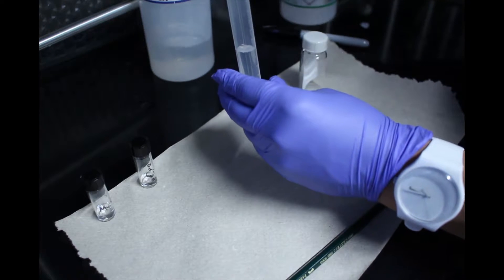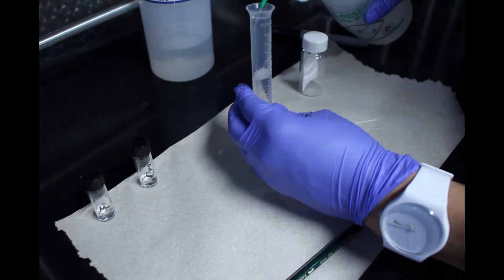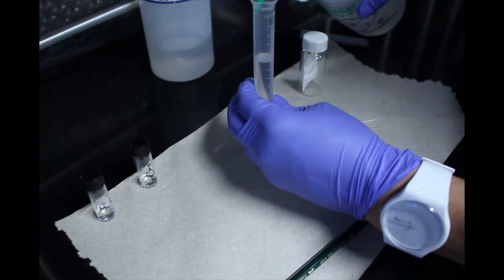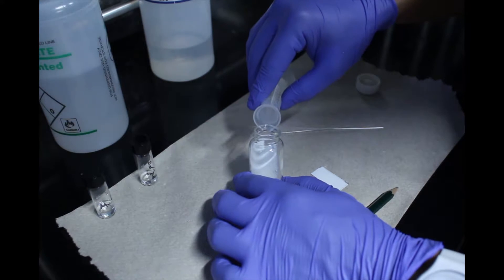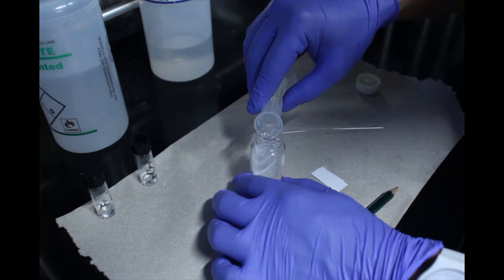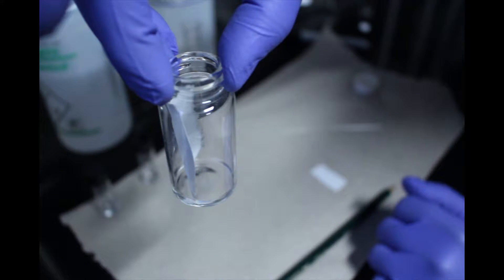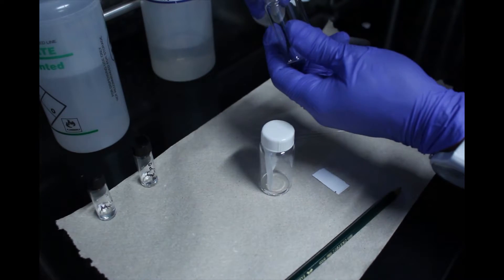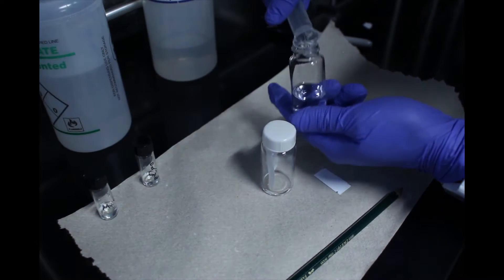To determine an appropriate solvent system, begin with a 50% ethyl acetate and hexanes mixture. Add enough of the prepared solvent system to cover the bottom of your TLC chamber equipped with a piece of filter paper. Store any extra solvent system in a sealed and labeled vial.